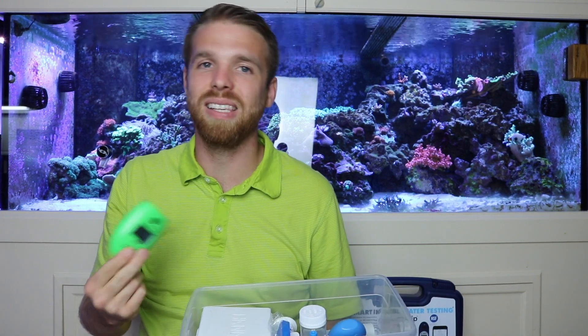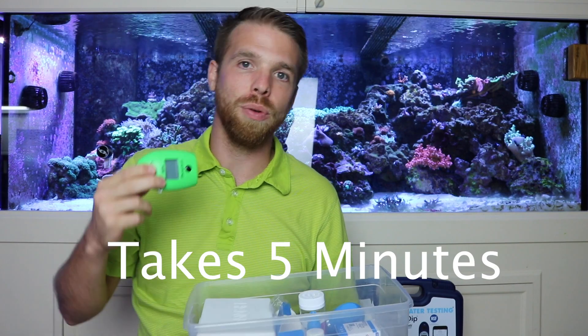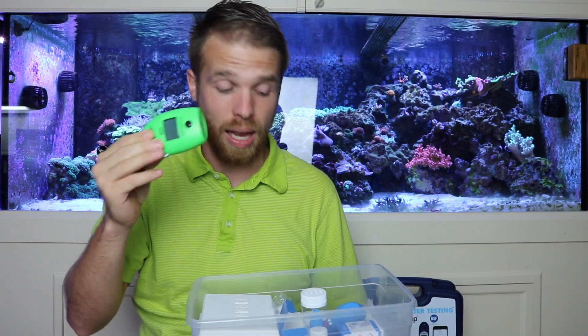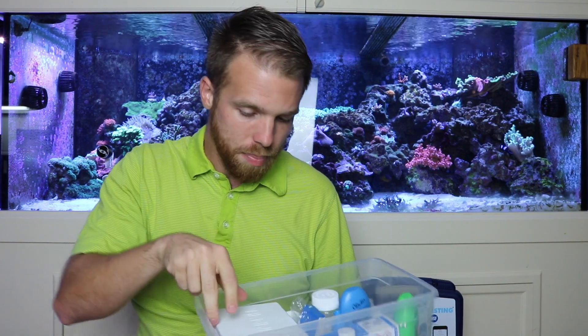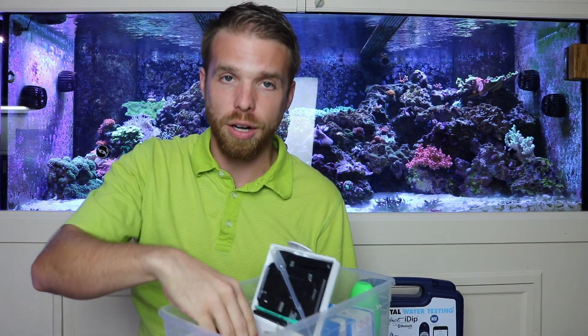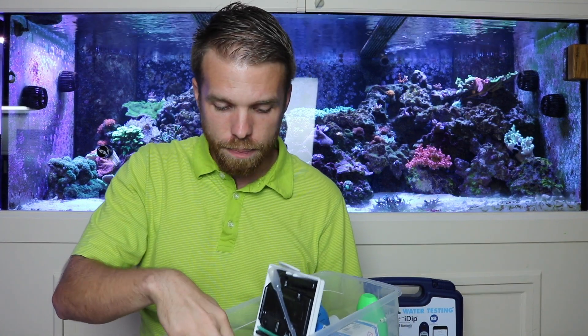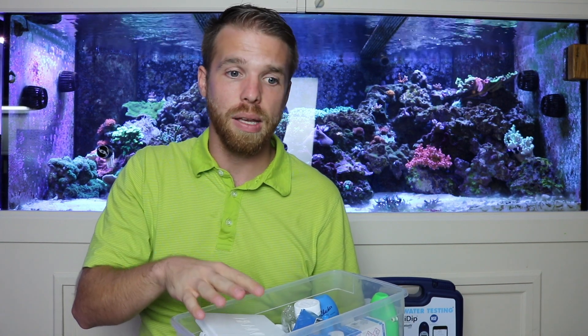The phosphate checker takes a little bit of time, and if you miss the timing on it that can be an issue, but I use it because it's accurate and I can trust it. The calcium Hanna checker — if anybody's looking to buy one, I'll sell you this one. We don't use it because it takes a lot of time and steps: you have to have RO water, tank water, two different reagents. There are just too many steps — it's not for me.